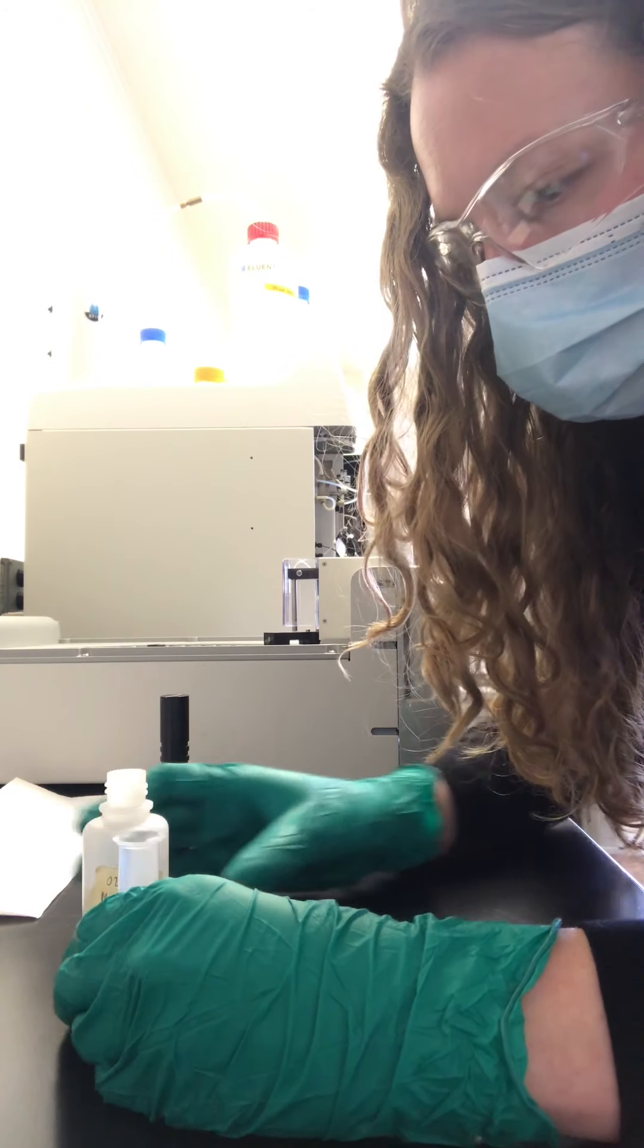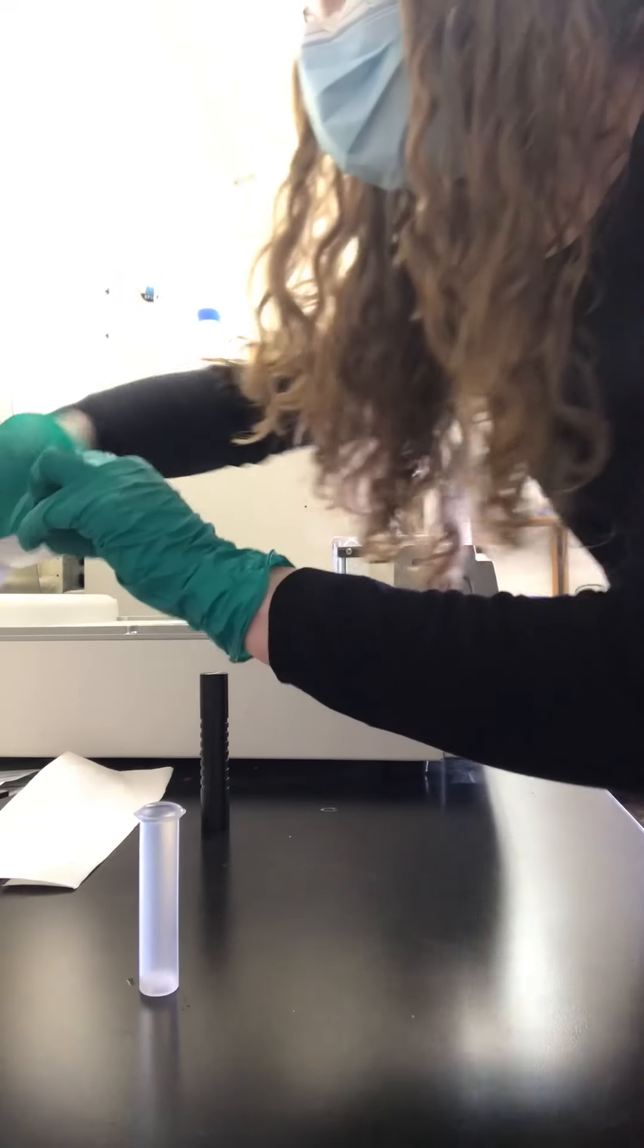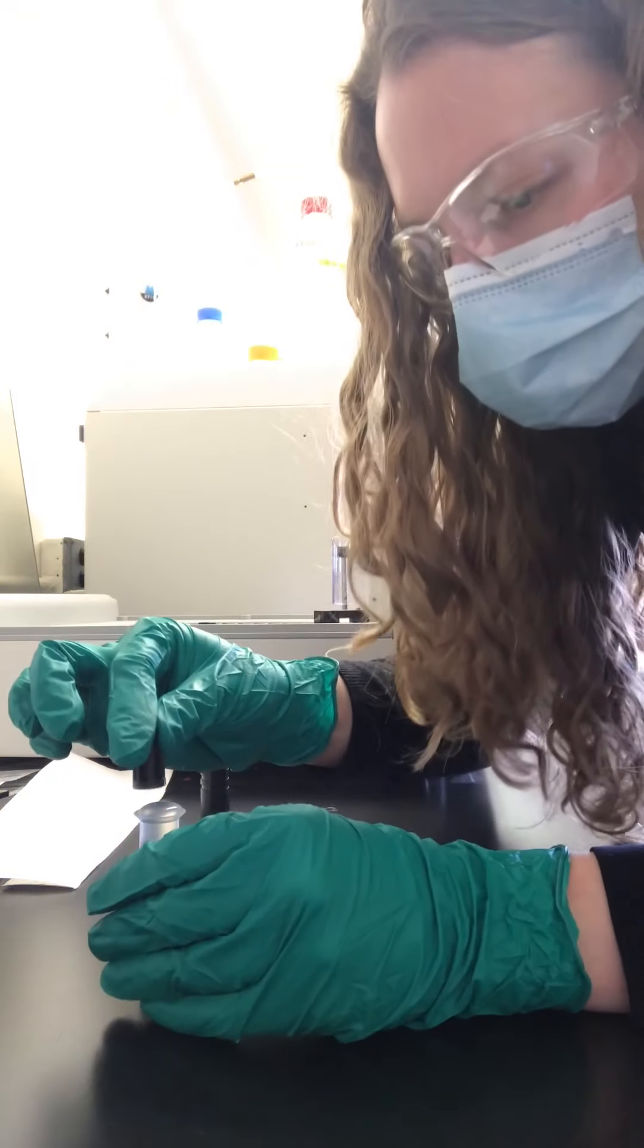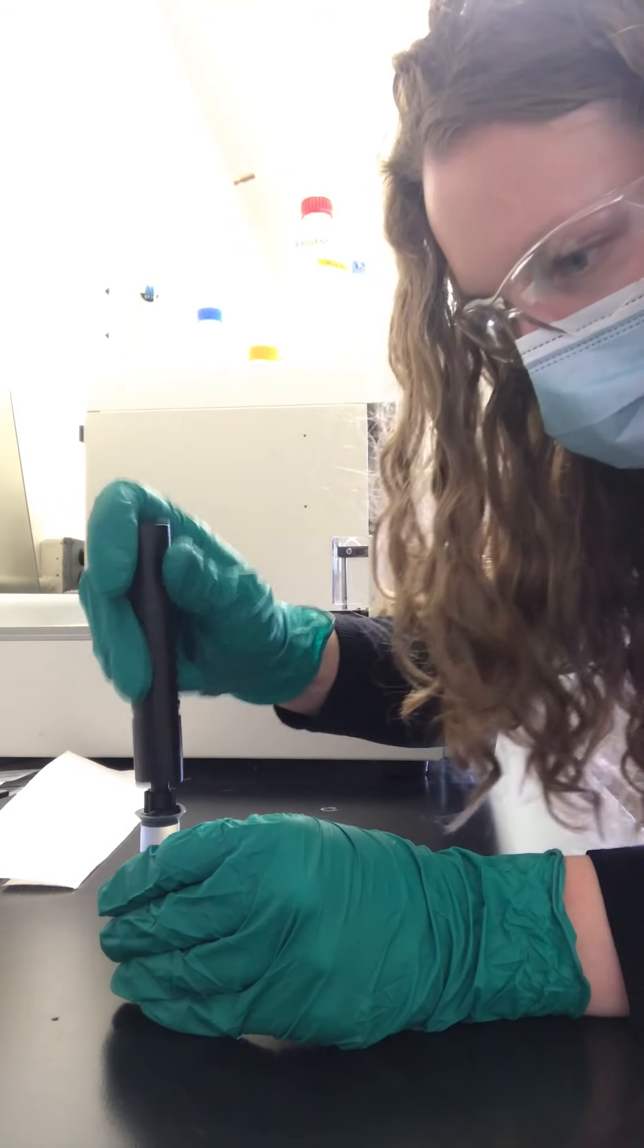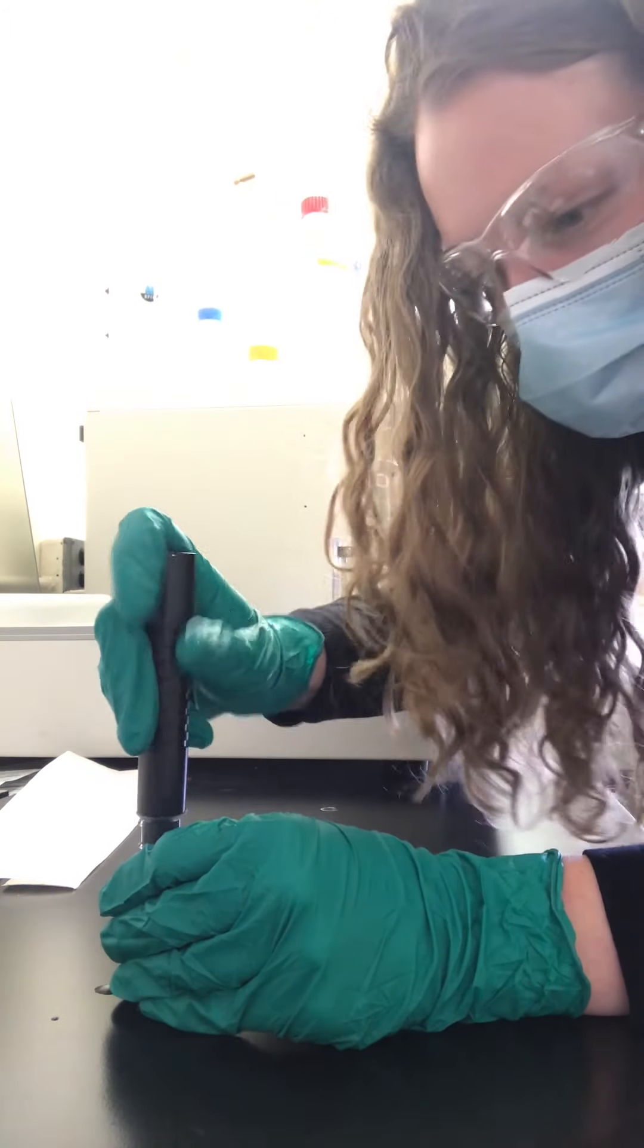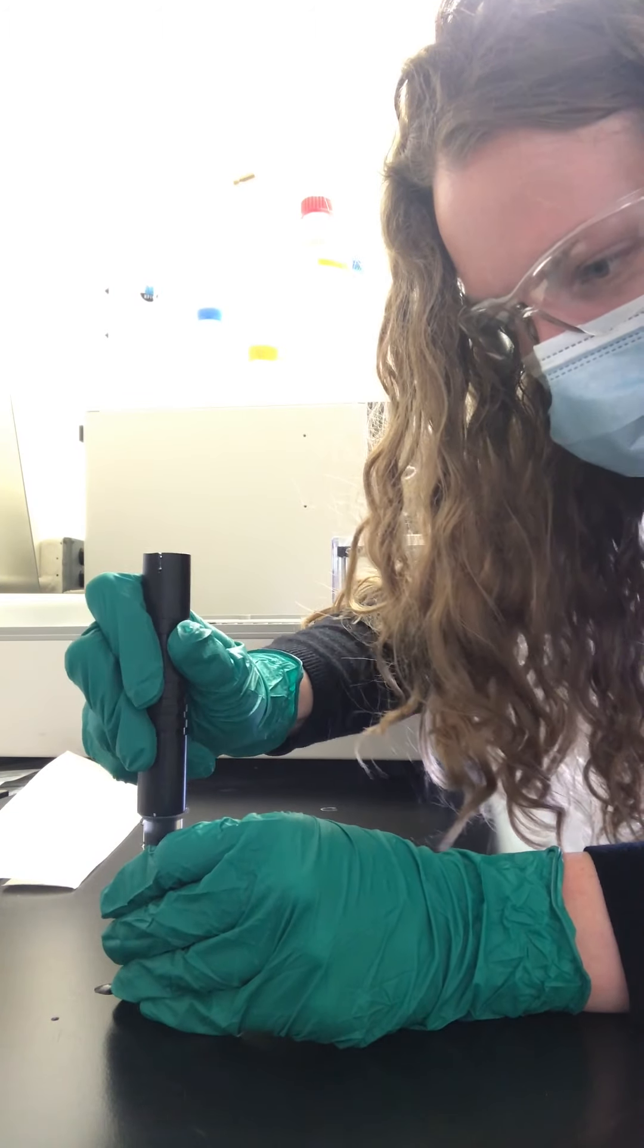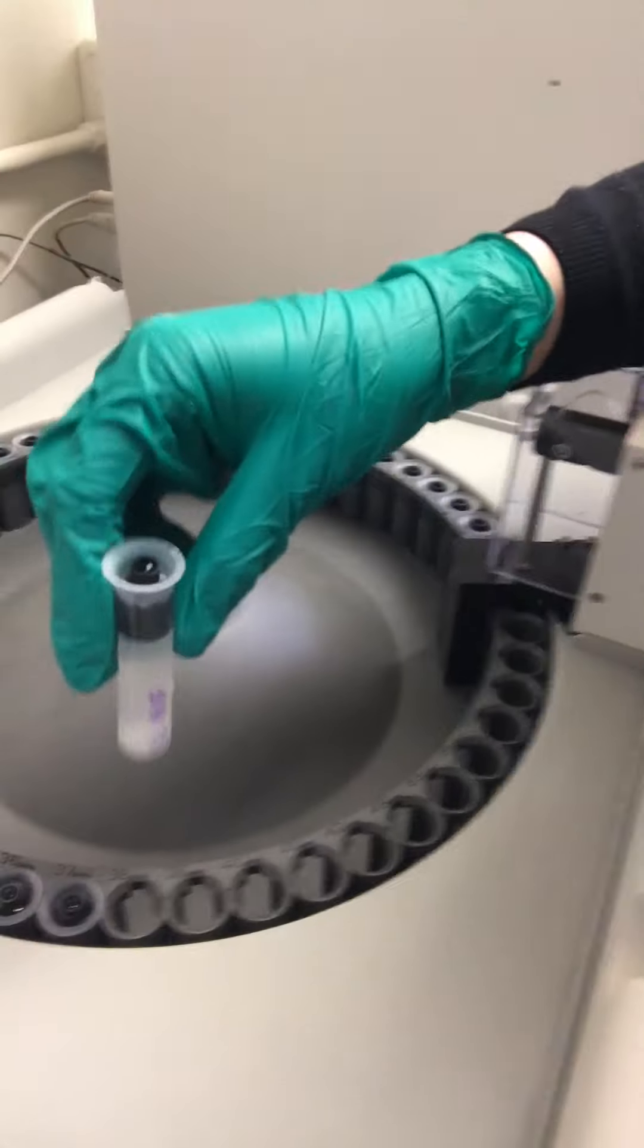So I pour this in. I've got just enough, and then we fix it with the cap here. I use this little tool, which is made specifically for this procedure, to press that down. And then it's ready to go into the vial holder here.